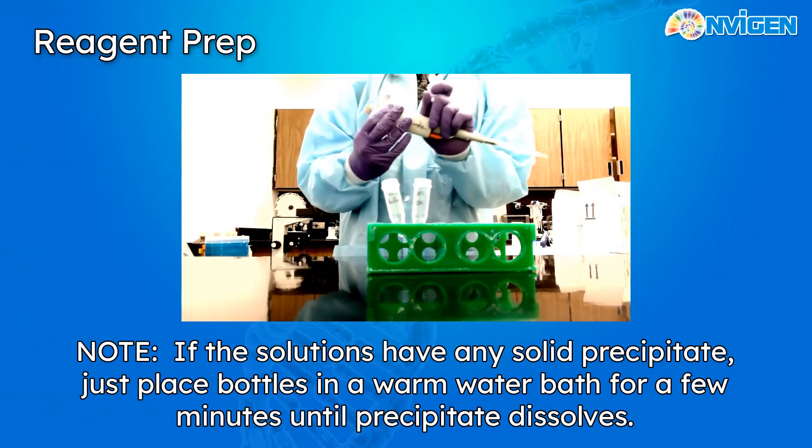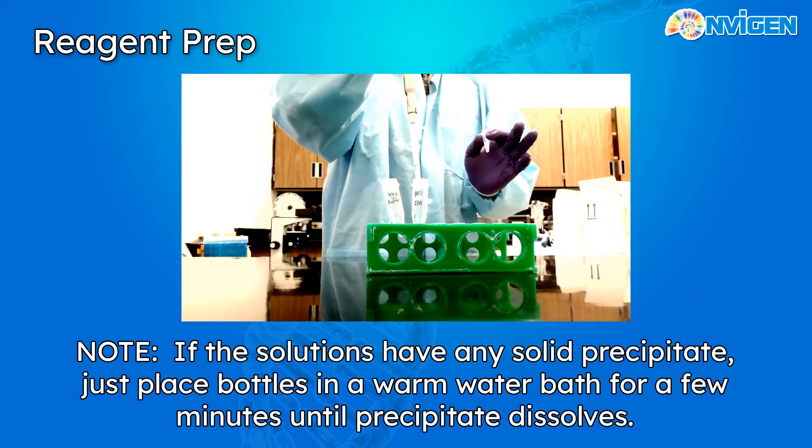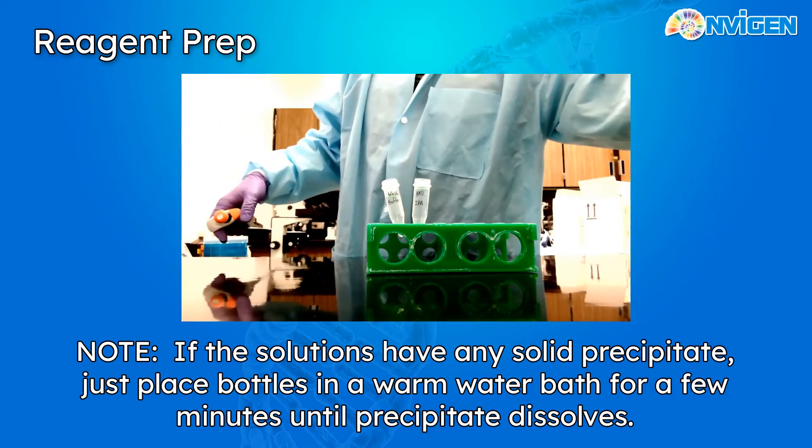If any of your reagents have precipitate, such as the lysis buffer or SDS, just place your vessels in the water bath until the precipitate dissolves. Vortex thoroughly and set aside.